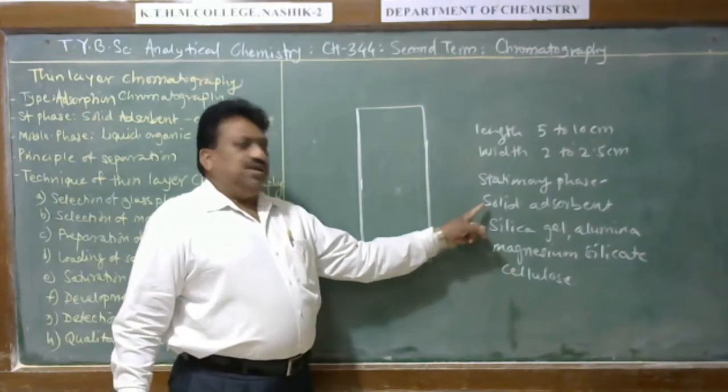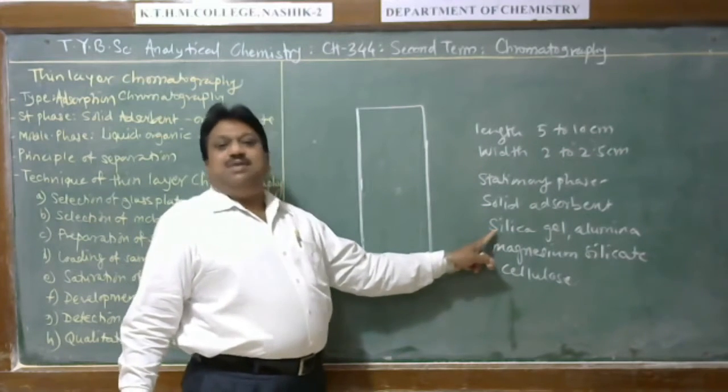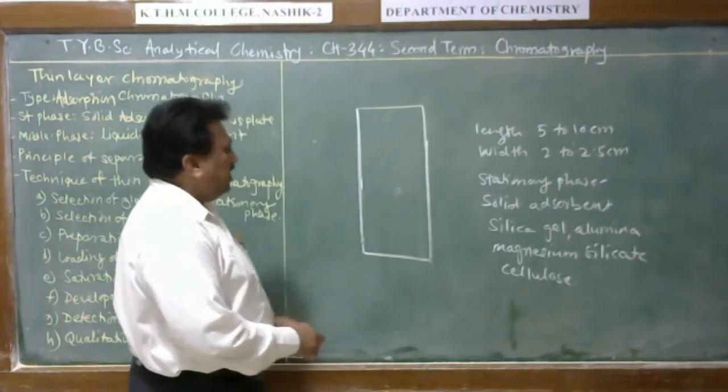Therefore, since it is an adsorption type of chromatography, this material acts as a solid adsorbent material. These adsorbent materials have a specific functional role.